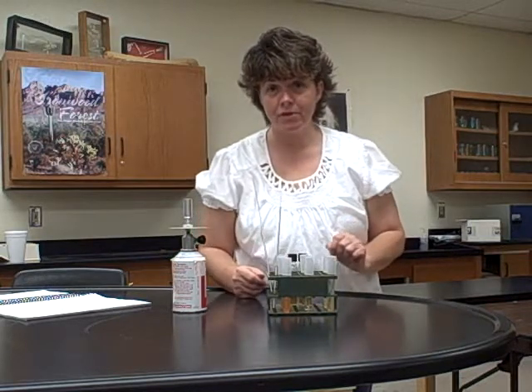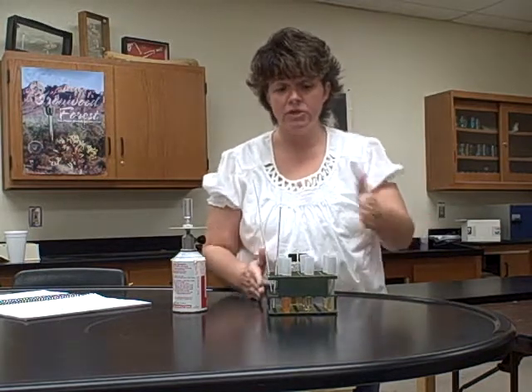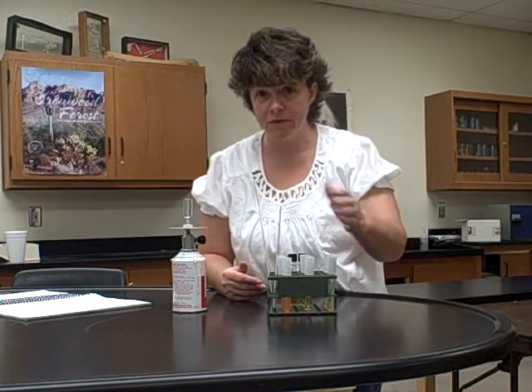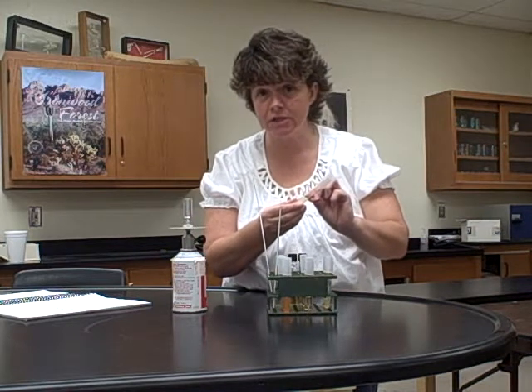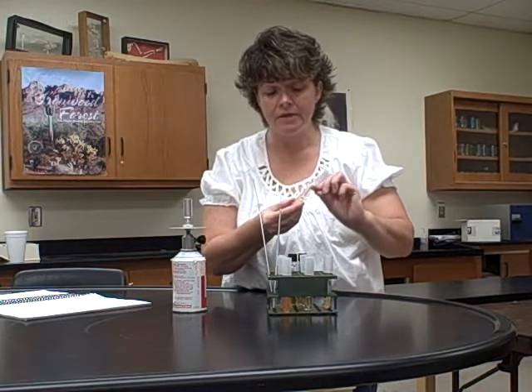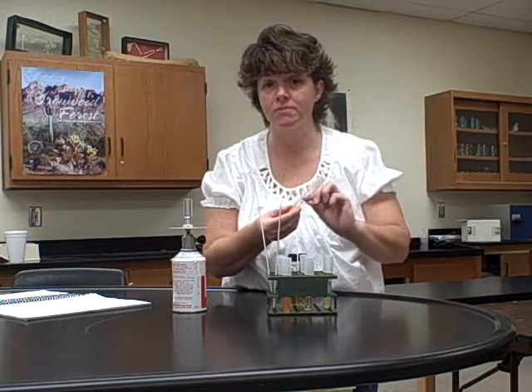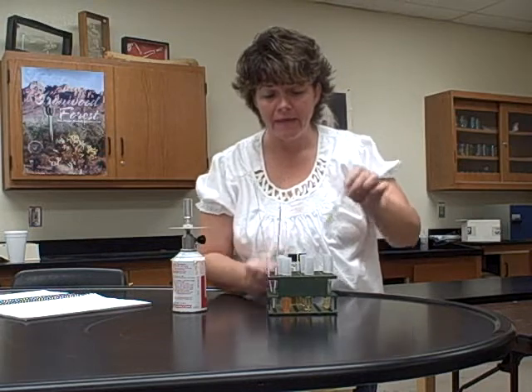So what I would recommend you do first, which is always recommended when transferring bacteria from one tube to another, is label your tubes first, okay? You'd use your Sharpie, and you're going to write the name of the bacteria that you're putting in there, and some sort of name to identify your group, or your name or something like that. You can also put the date on there if you'd like.